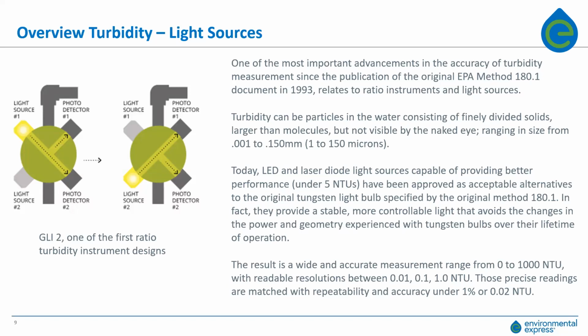Now, the white light turbidimeters measure the particle scattering of light from a tungsten light source, and the wavelength of the spectral peak response of the detection system should be between 400 and 600 nanometers. A tungsten filament white light source accomplishes that. The Mitchell LED simulates that as well.